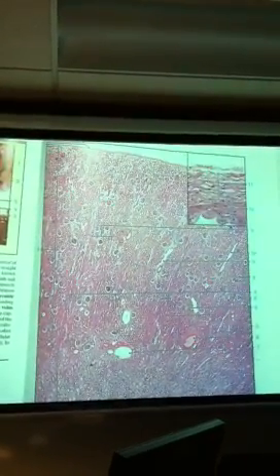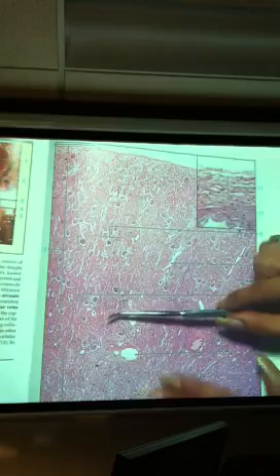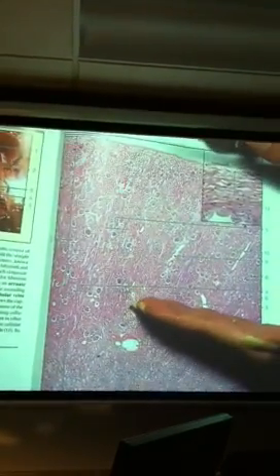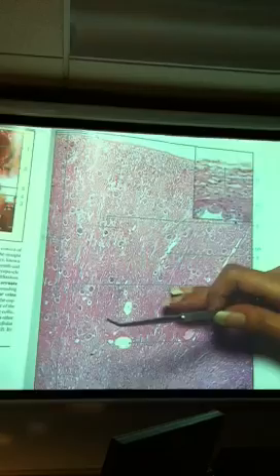This is a cross-section of a kidney. The kidney, as we said, is made up of two distinct layers: the renal cortex and the renal medulla.